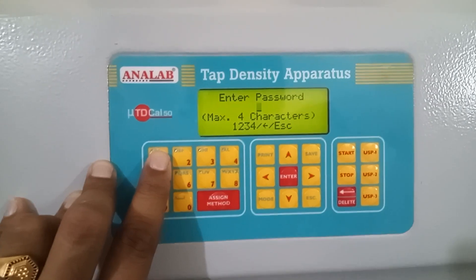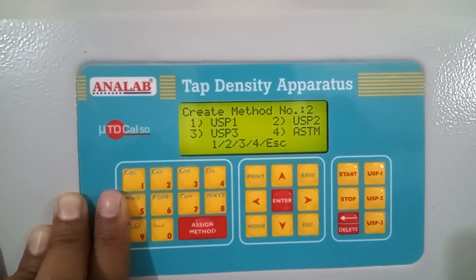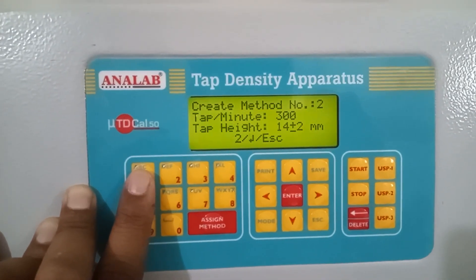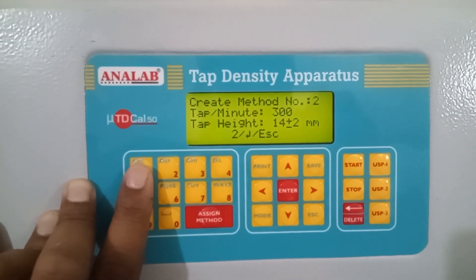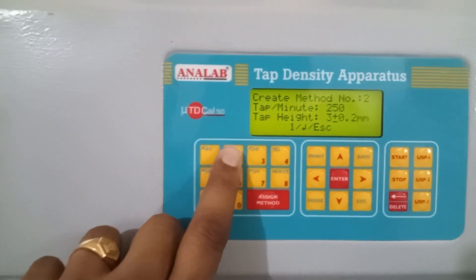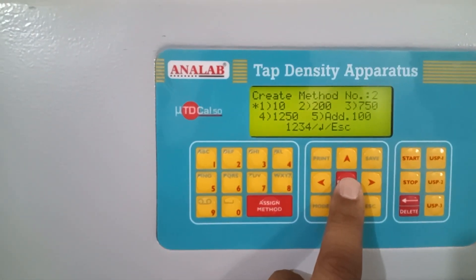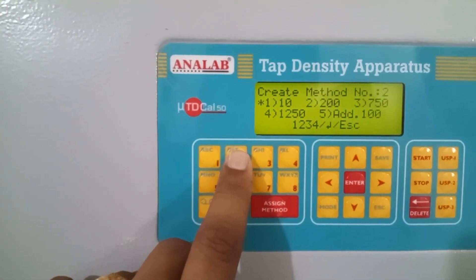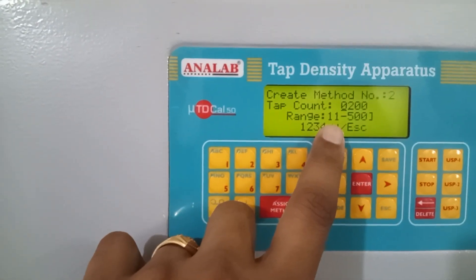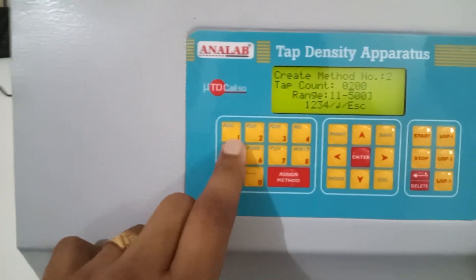It will ask for a four-digit password. There are four different options. We will select number one which is USP1. Then it will ask for the number of tabs for USP1 and USP2. We can edit each of these tabs. If you press enter, these are the different tab options available. We will select all of them. You can also edit these tabs — for example, you can select from 11 to 500 tabs. Right now we will select 150 tabs for example.